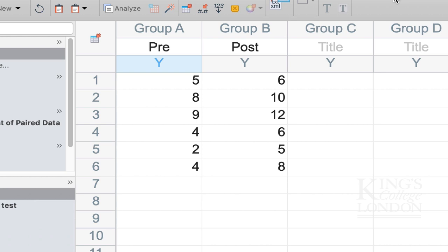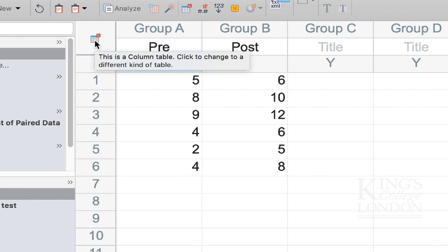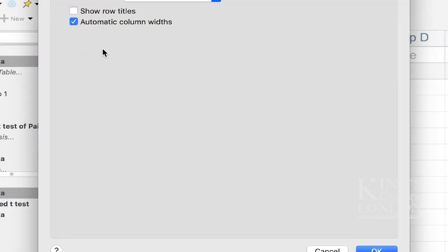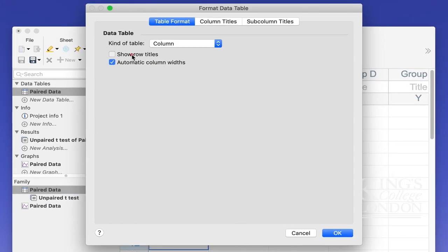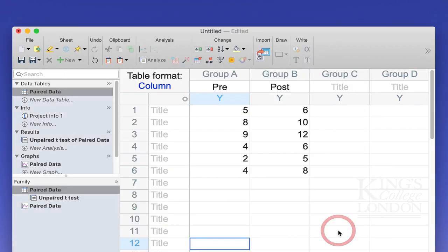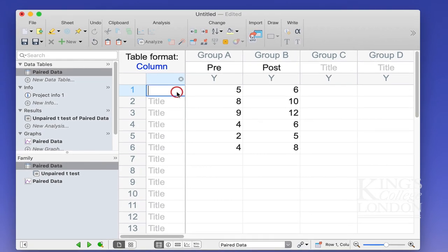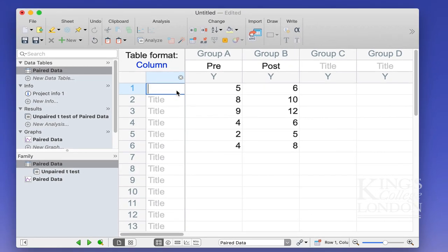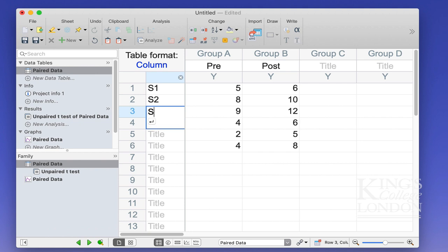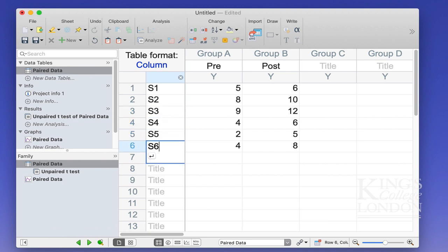We can quickly show this by clicking on the formatting bar here and show row titles and press OK and enter in our subjects. So this is subject 1, subject 2, subject 3, subject 4, subject 5 and subject 6.